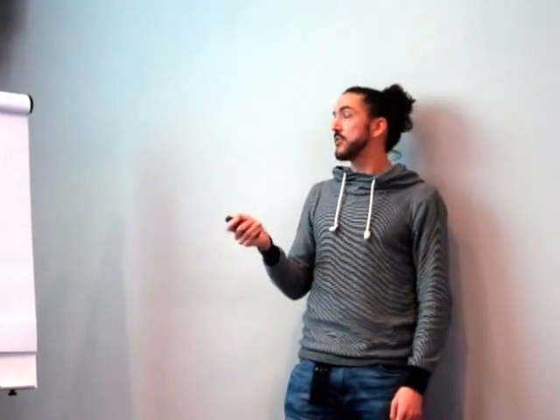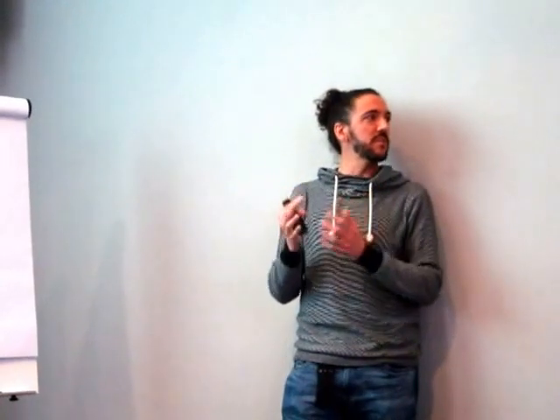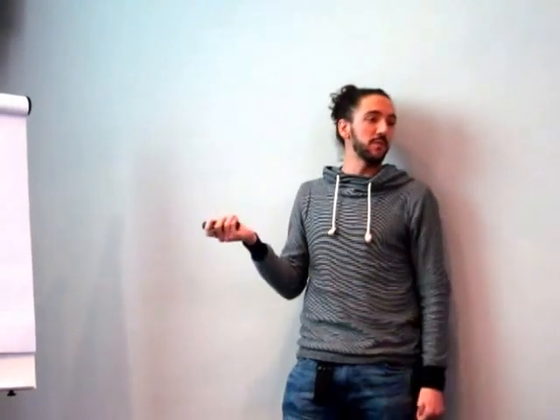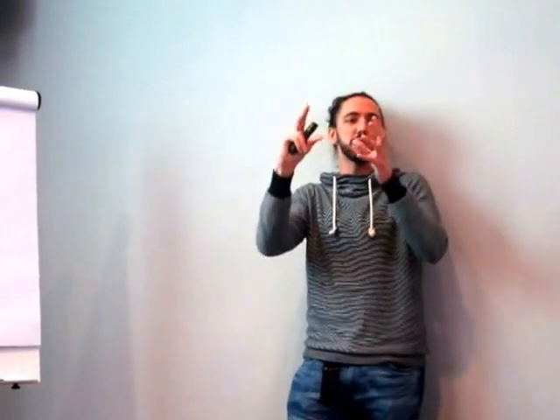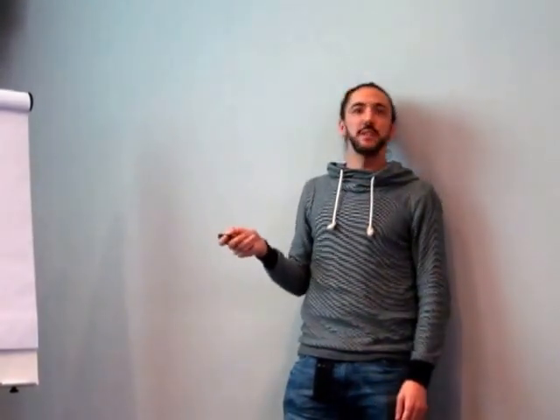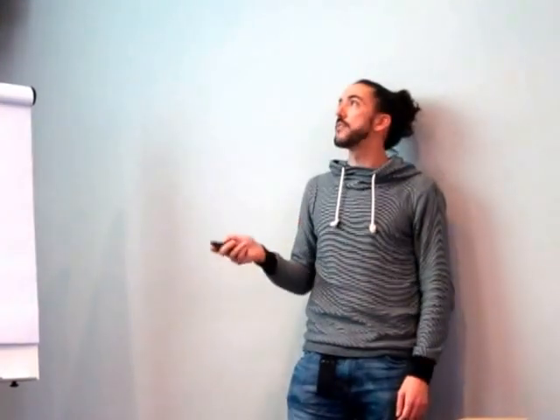And for this information, you don't need a very nice model. You don't need a really good model from a physical point of view. So if I put the structures more or less where I think that they should be, I can still use this evaluation method. Okay, so thank you very much for your attention.